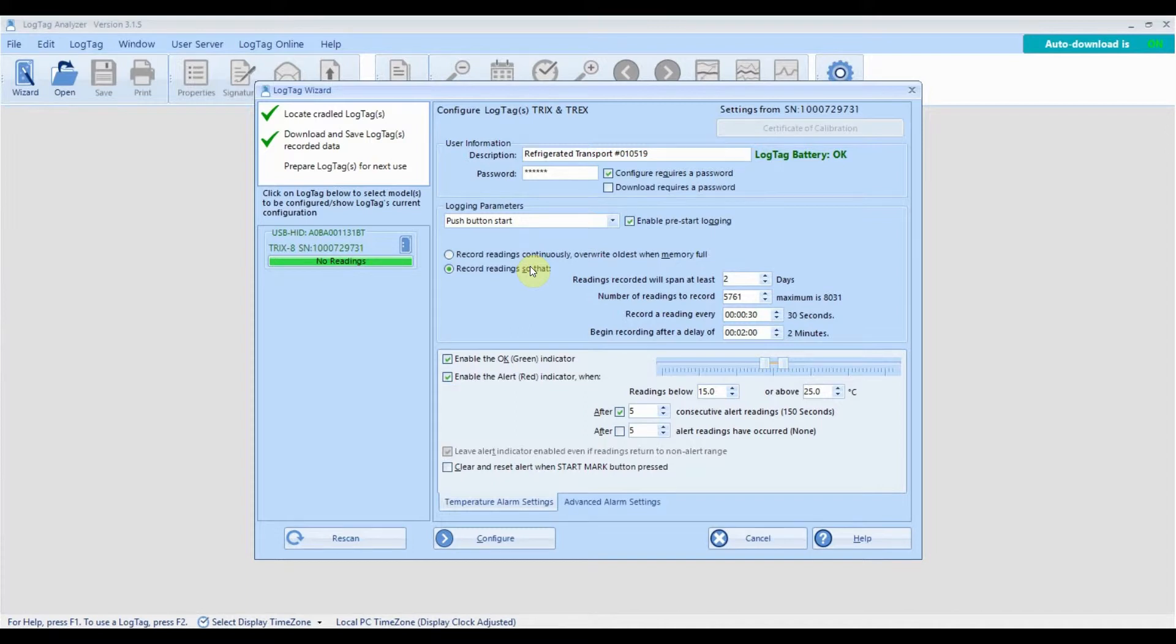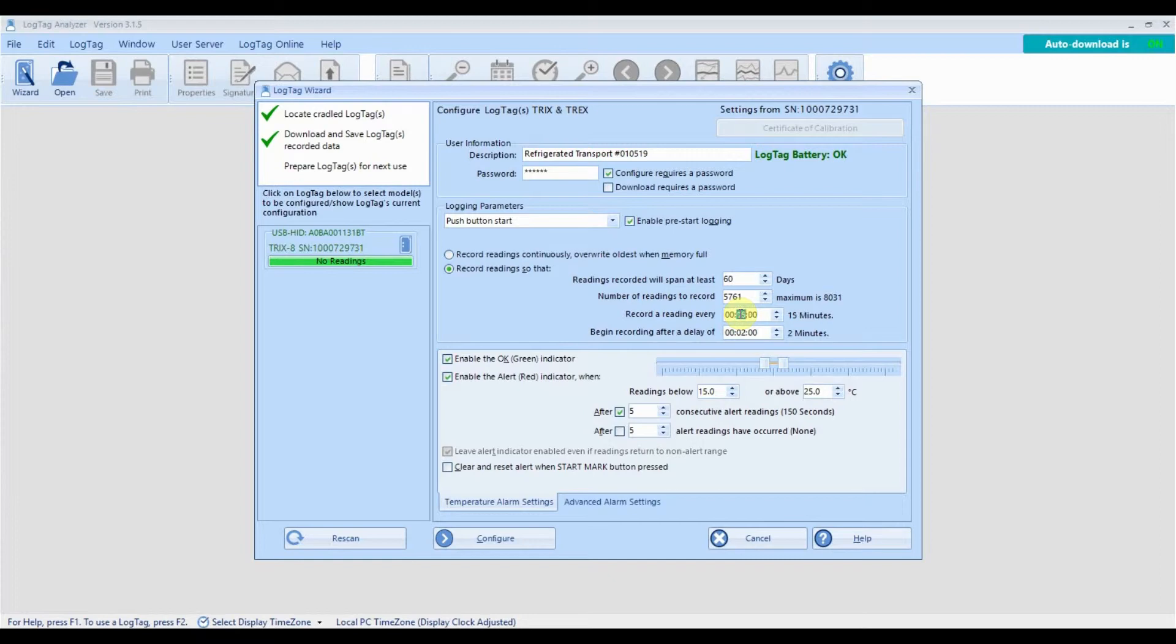The number of readings taken is determined by the duration and frequency of your readings. Specify how often you want your logger to take a reading and the maximum number of readings the logger can take will be displayed.